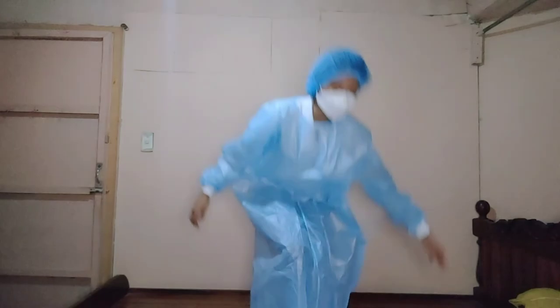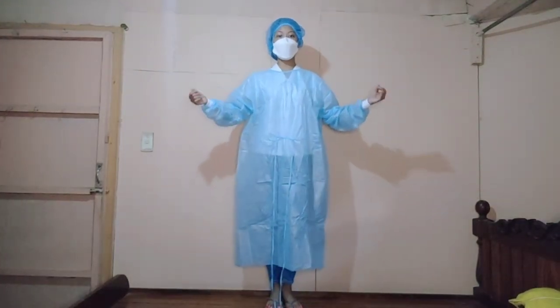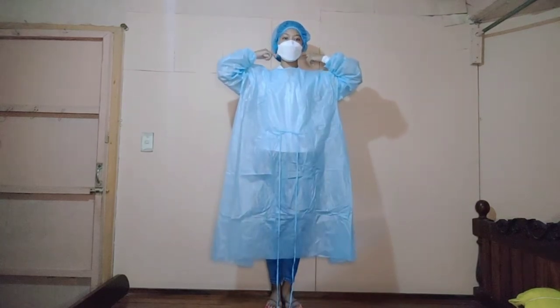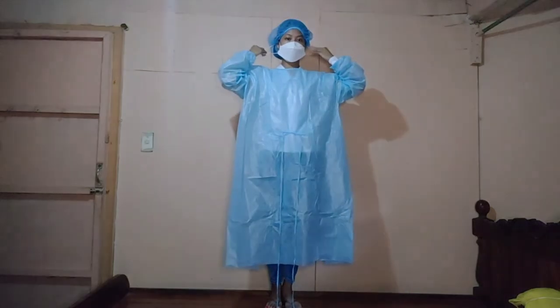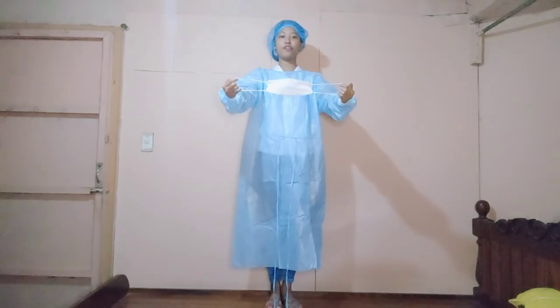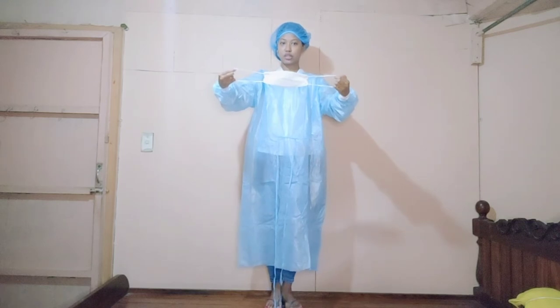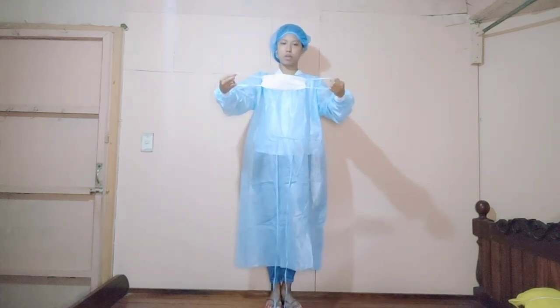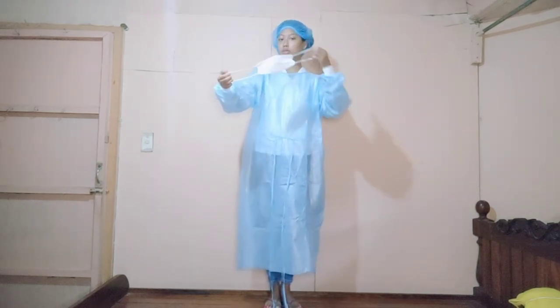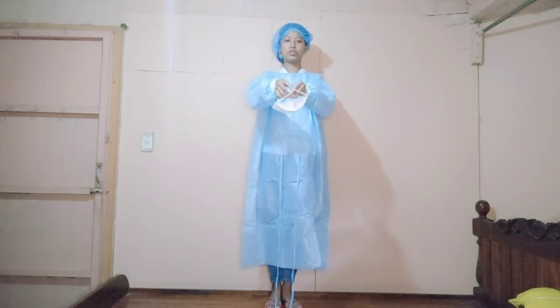Next, remove the mask. I have a loop mask, so we remove both loops simultaneously — not one at a time, but simultaneously. Make sure to hold the mask away from you. The exposed front part should not be touched — hold only the strings or loops, since they are the least exposed parts. The possibility of contamination is lesser on the strings than on the front part. Dispose of the mask.